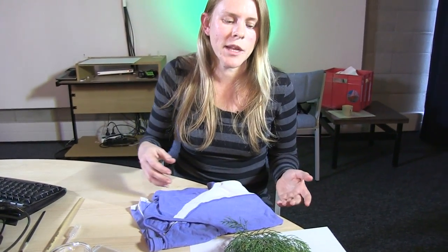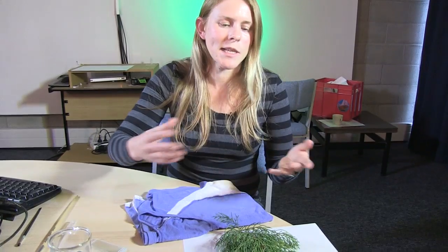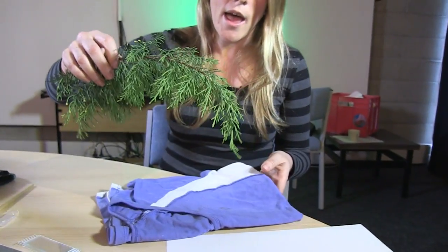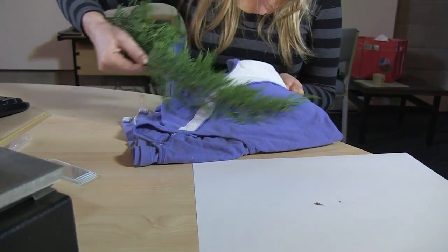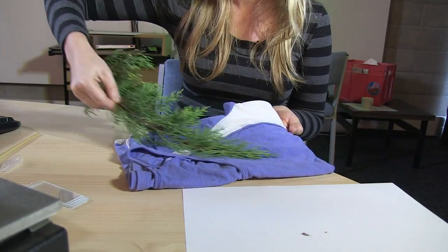So I'm going to simulate a person coming in contact with vegetation or basically being in the environment where pollen is about by using this branch here and dusting it against this piece of clothing like so, just simulating someone coming in contact with vegetation.